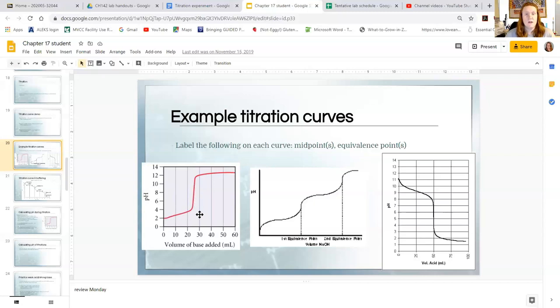Okay. So what we're going to do is the very first time you titrate it, you don't even measure the pH curve. You're just going to titrate it like we do in 141. This is called a rough titration, so you don't need to be very picky about getting a pale pink color. But when you start to see the pinkish color sticking around longer and longer, slow down, go drop by drop, so you can find the equivalence point. And so that's the point where the pH is changing the most rapidly. So you're looking for the rough titration to give you an idea of where you need to slow down.